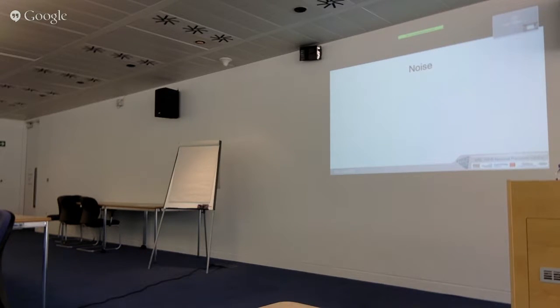I'm Andrew Dowsey. We're in the Electrical Engineering Electronics Department in Liverpool University. We do signal processing and statistical algorithms for mass spectrometry data, including data compression and new centroiding and noise reduction.